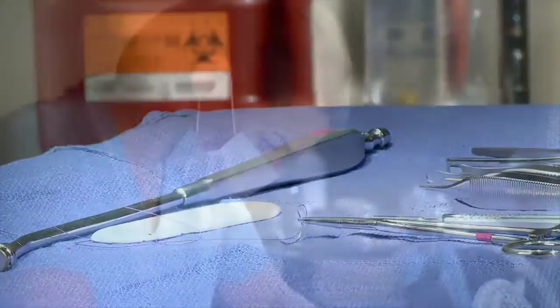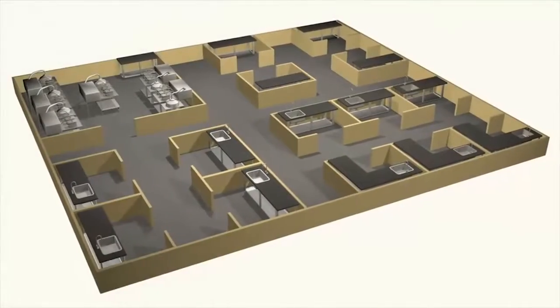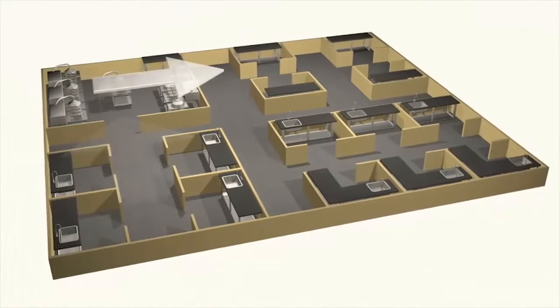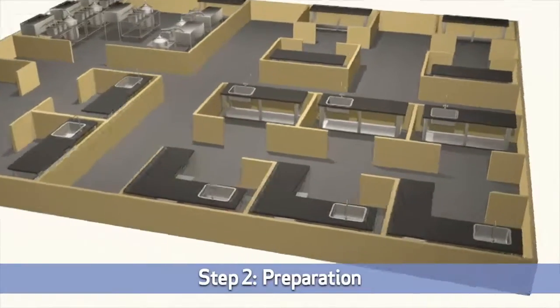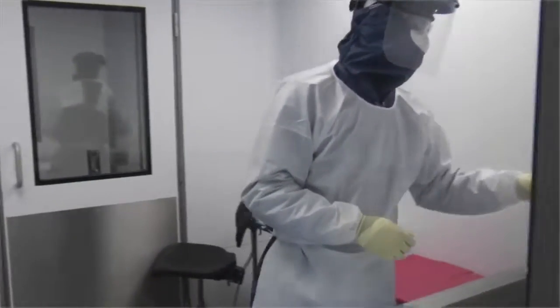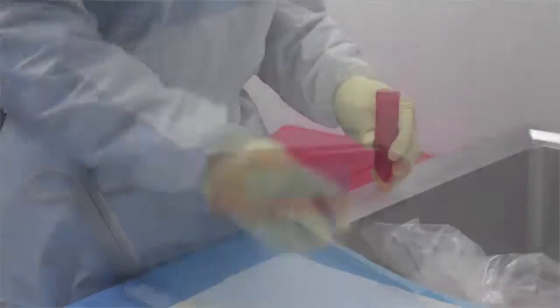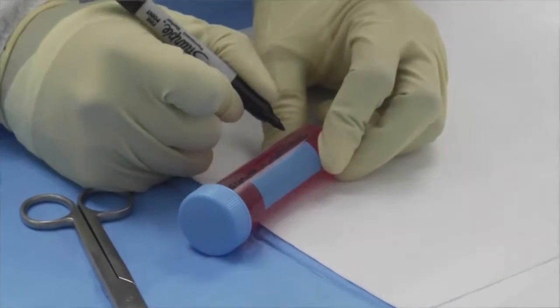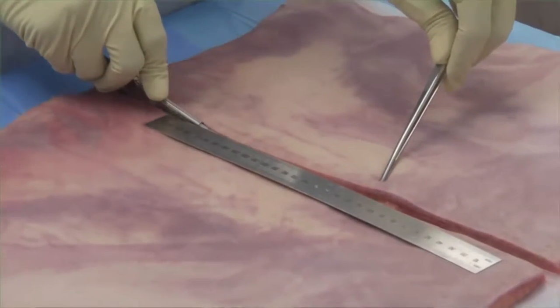Approved tissue is surgically removed within 24 hours in an aseptic environment and is triple packaged for shipment to MTF's facility. Each processing step takes place in a different lab, with the tissue being passed from one lab to the next. The first lab is preparation. First, a sample of the solution that the tissue is in is sent to an independent lab for bioburden testing. MTF's pre-processing serology and nucleic acid testing must meet or exceed both FDA and AATB requirements. Only donors who pass all of the tests are released by one of our medical directors for preparation.